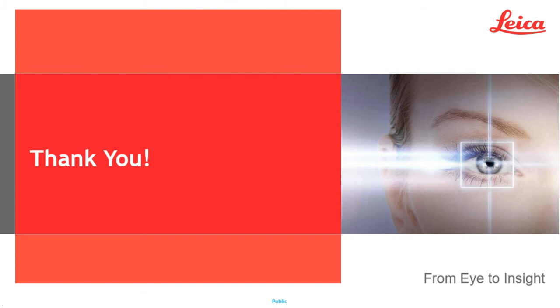And this is for cells versus straight-lined objects and things like that. So there are already pre-programmed sets that we use, and I don't know what those specific features look like off the top of my head. I can email that out later, but there is a wide range of features that you can use.